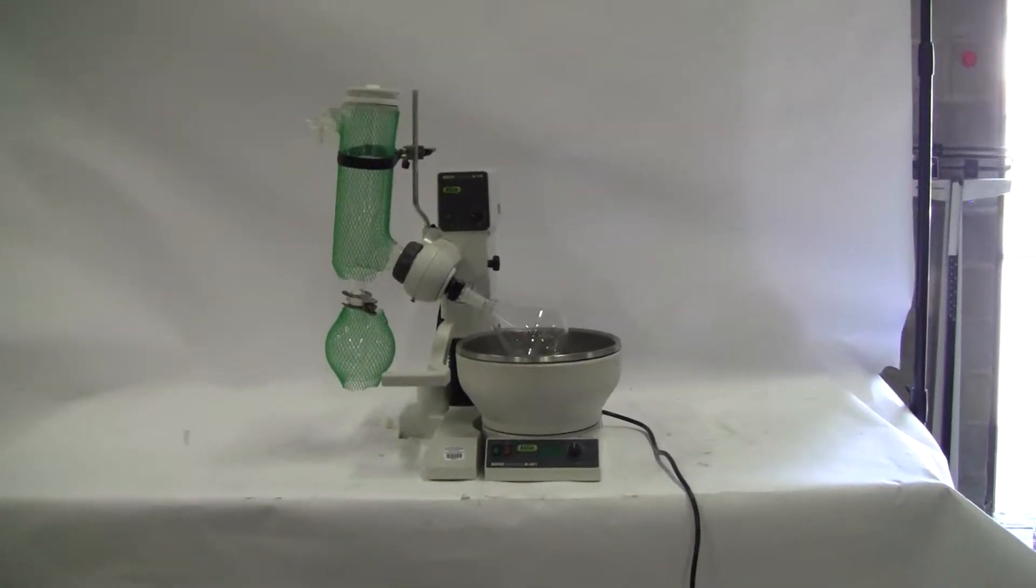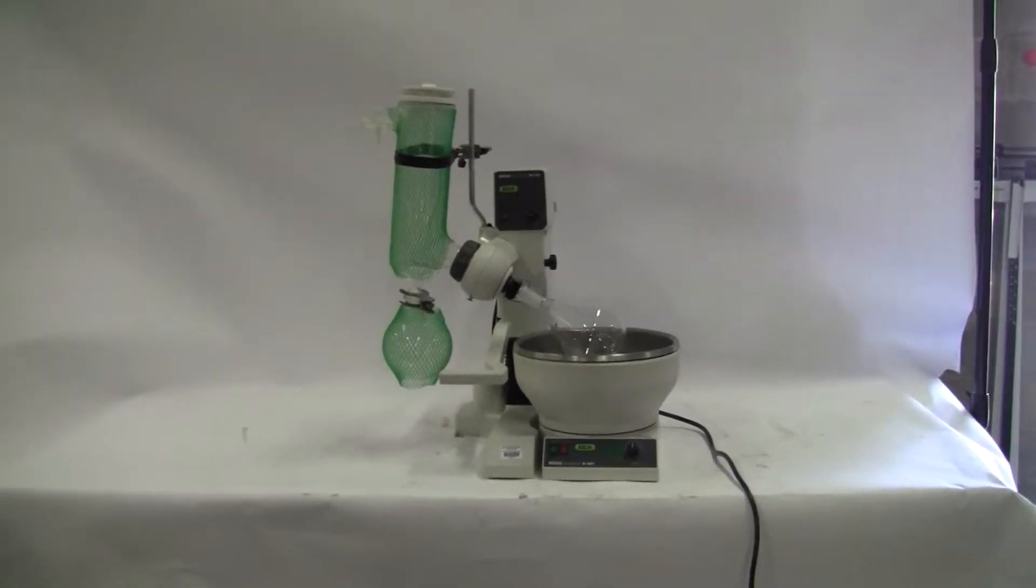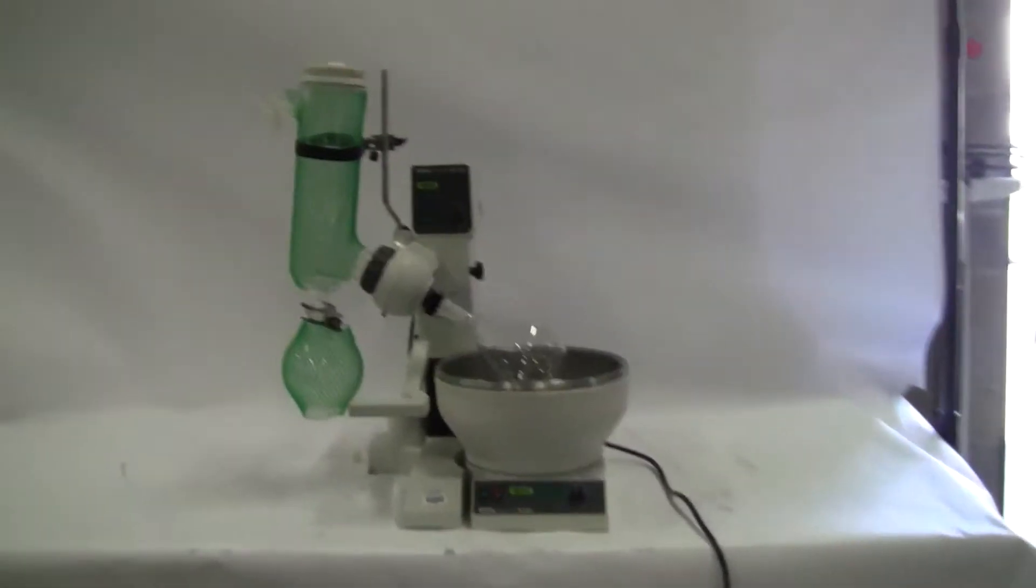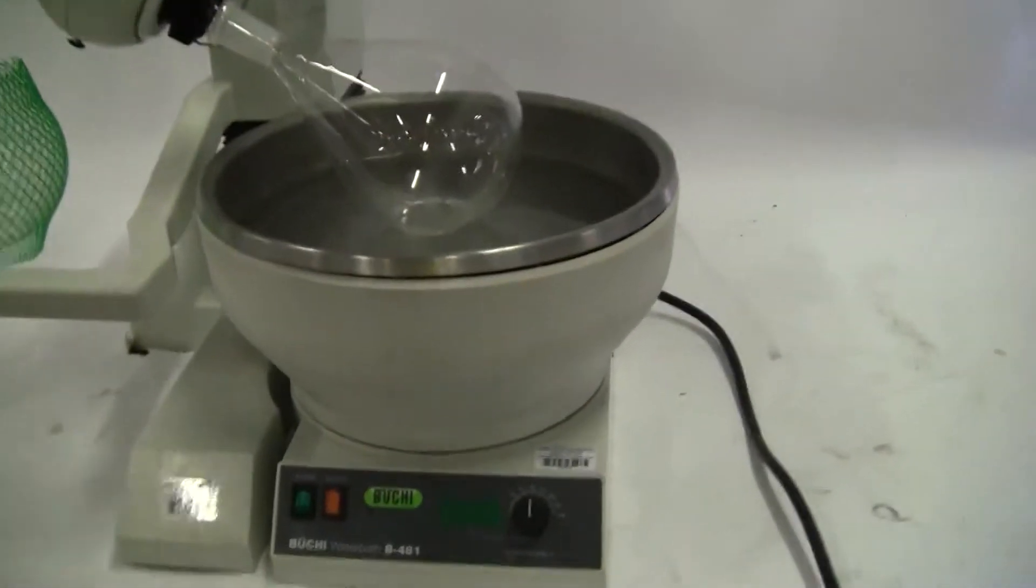Hi, this is Cody Young from Hi-Tech Trader. Today we're looking at a Buggy R114 and a 481 digital water bath that goes with it. Come up and power the instruments on.